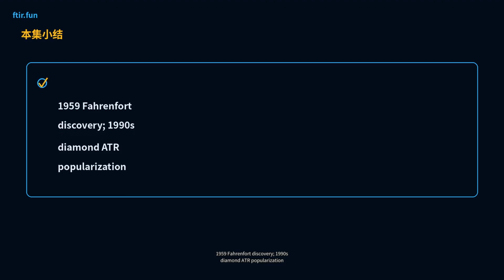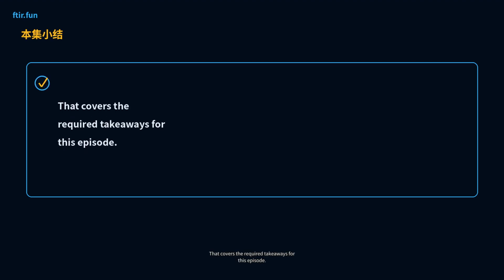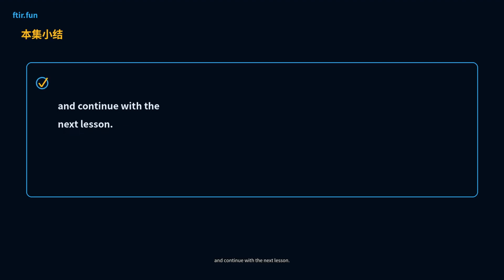1959: Fahrenfort discovery. 1990s: diamond ATR popularization. That covers the required content for this episode. Practice with real spectra on Fun and continue with the next lesson.